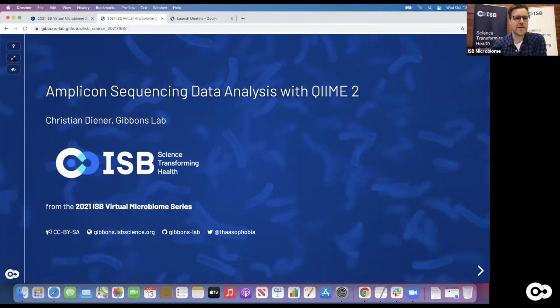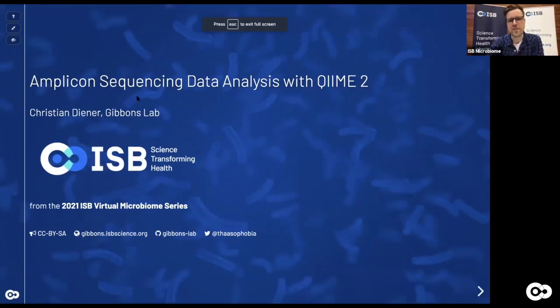And we will start today by looking at Amplicon sequence data analysis with Qiime 2. It's basically a standard pipeline that's used these days to analyze mostly Amplicon sequencing data, in some cases also metagenomic data. And since we still have a little bit of time, let's introduce the motivation for the course a little bit. It's mostly aimed at getting you up to speed, from getting raw sequencing data from any sequencing provider or your own core unit, and then going all the way to generating some kind of scientific insight.